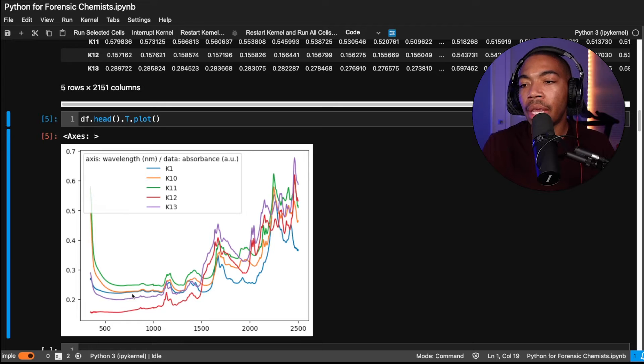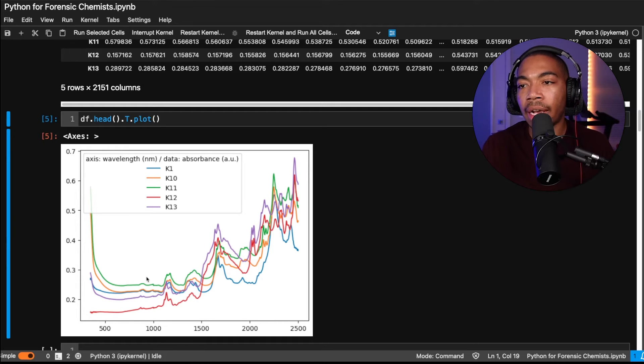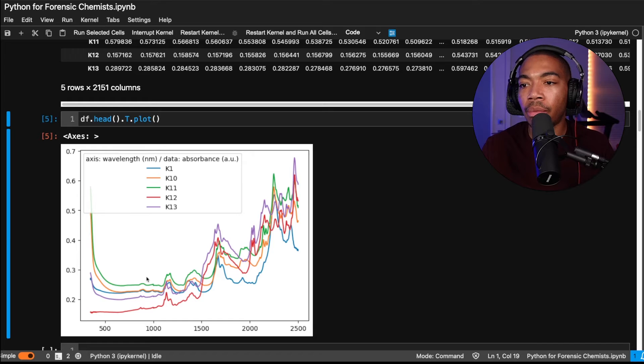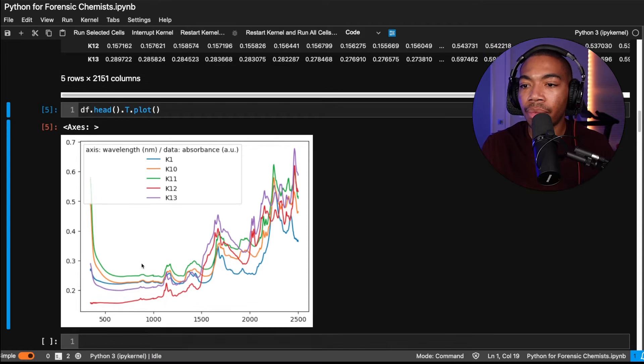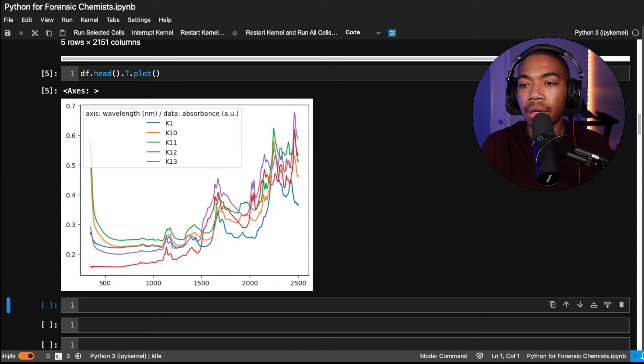We see that we have different absorbance values, which may or may not be due to the actual changes in chemical composition, but again, could be due to other experimental artifacts that we want to control before we do even more advanced processing.